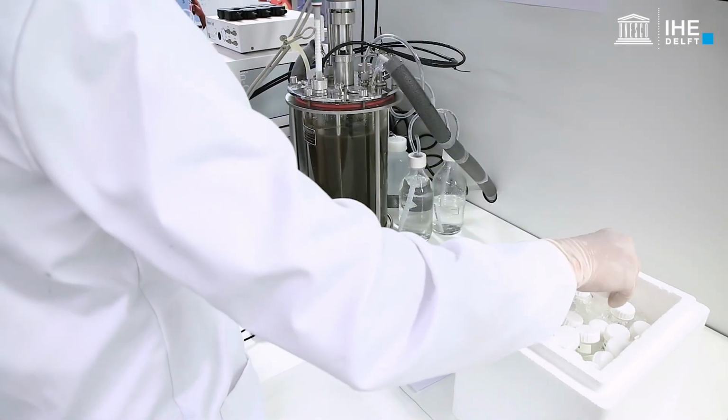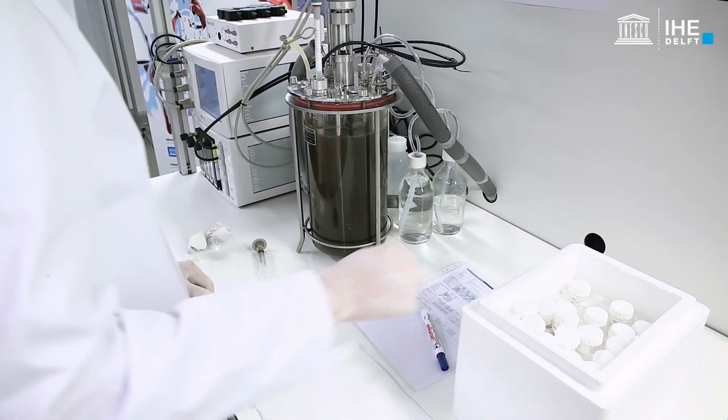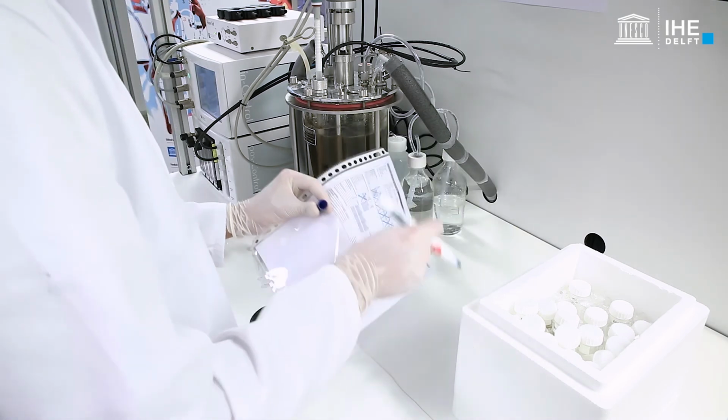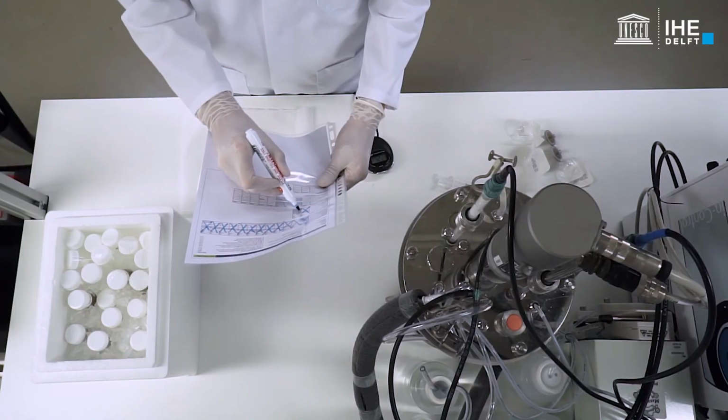Confirm that all the required samples have been collected. If possible, carry out immediately the analytical determination of the parameters of interest. Otherwise, follow the required procedures for the preservation of the samples until they are analysed.